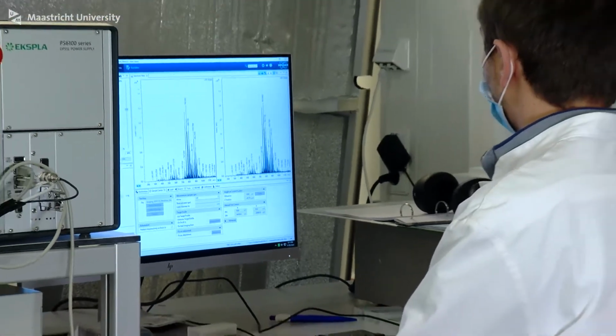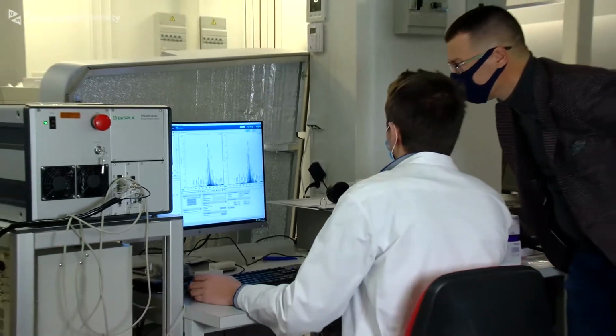M4I is a unique infrastructure here on the Maastricht University campus. What makes us unique is that we are able to look at the molecular complexity of many different surfaces. Being very close to the hospital, we actually work a lot on patient-based problems, which means we work on biopsies, on tissue sections, where we're trying to provide the clinicians with molecular profiles that help them precisely diagnose their patients. These molecular diagnostic profiles are the enablers of personalized medicine of the future.